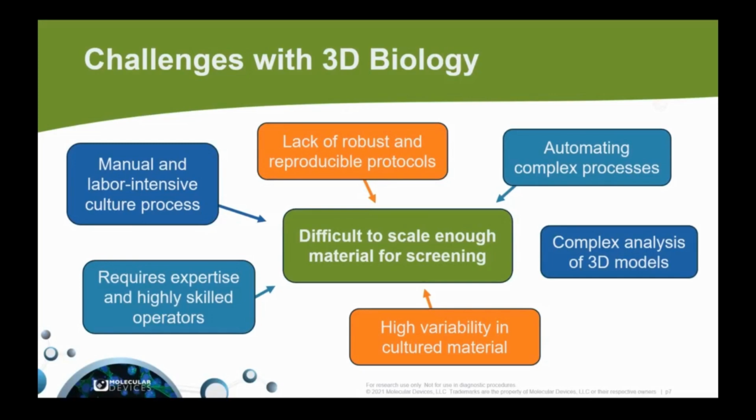Some systems themselves lack robust methods, meaning that maybe slight differences in reagent composition or operator technique can lead to variations. And many systems also lack industry consensus, and so multiple protocols are being used or maybe even still developed for certain models.